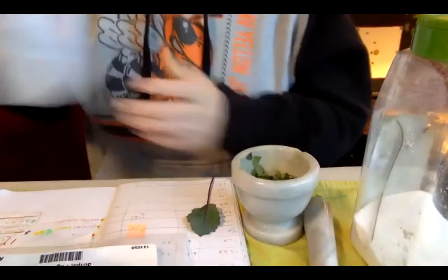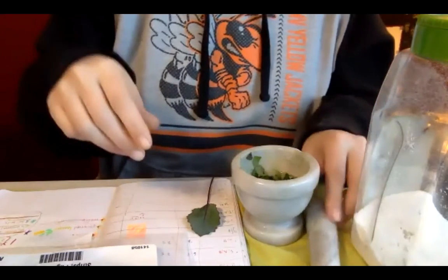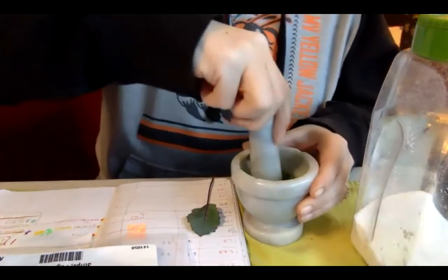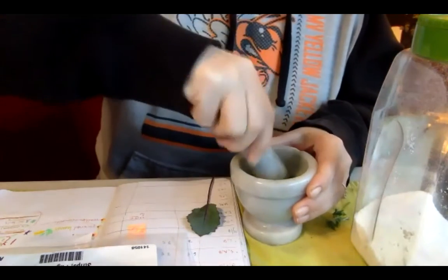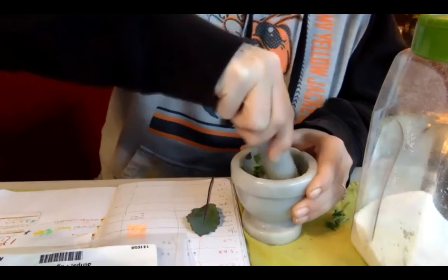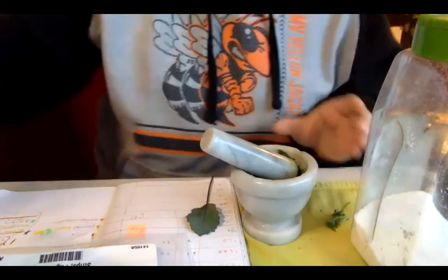I think we're supposed to measure, I'm supposed to put 15 mils, but I'm kind of covering everything. It's really not that exact. At this point, I do want to separate solid from liquid. Again, if you don't have a mortar and a pestle, you can do this at home.